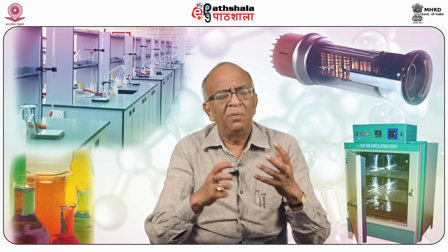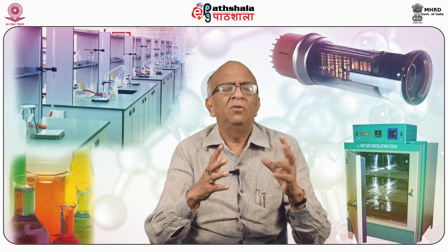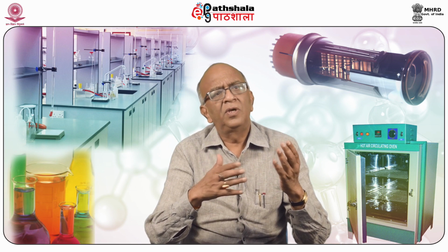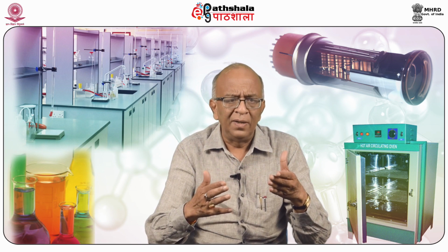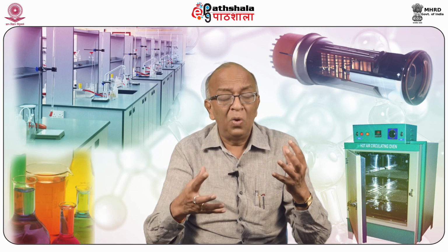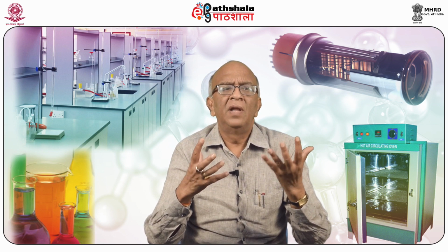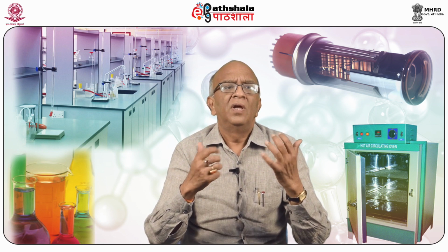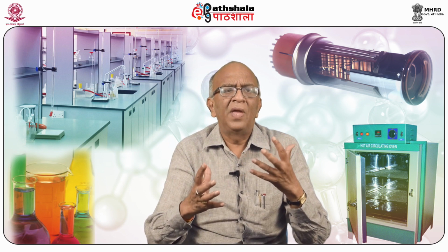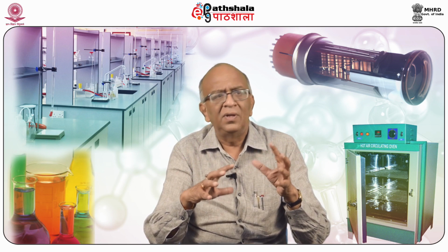So the objective of my lecture here today is very simple. As you keep your home clean, you keep your working table clean. Similarly, in the case of laboratory, where you have a large number of chemicals, reagents, and glasswares, you have to keep them at proper places. Reagents should be placed at proper places.